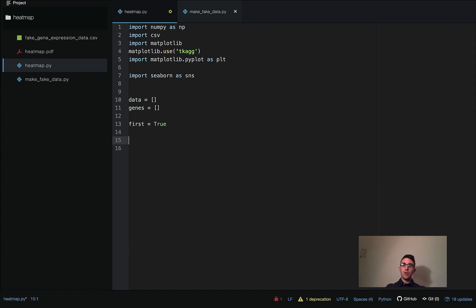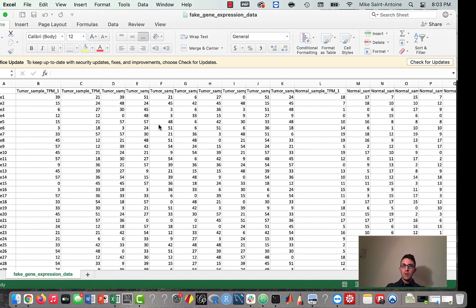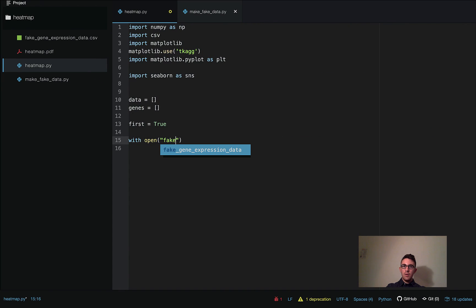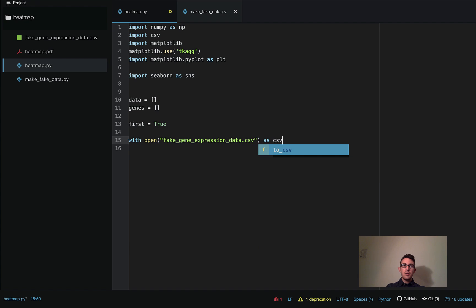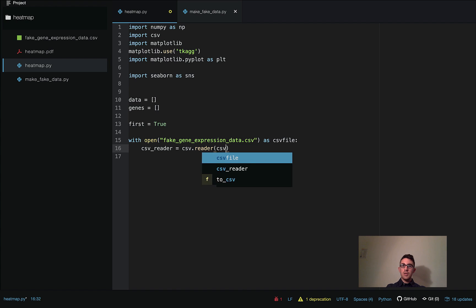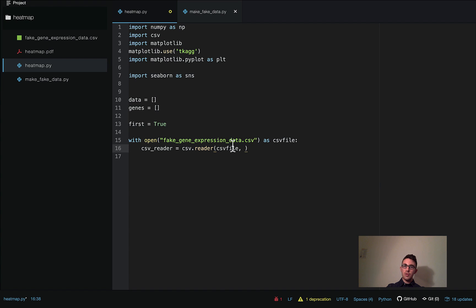Now we're going to start opening up our CSV file. I'll say `with open` the file named `fake_gene_expression_data.csv` as `csv_file`, then define the CSV reader as `csv.reader(csv_file, delimiter=',')` — because it's a comma-separated value file.